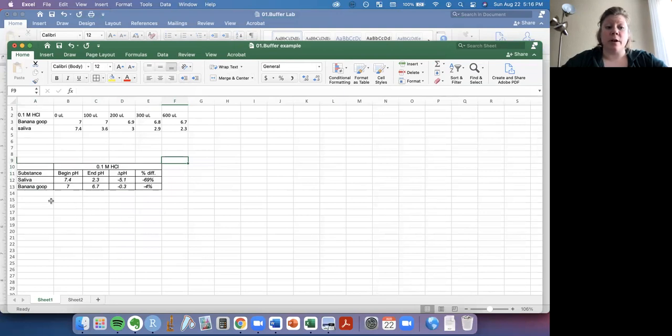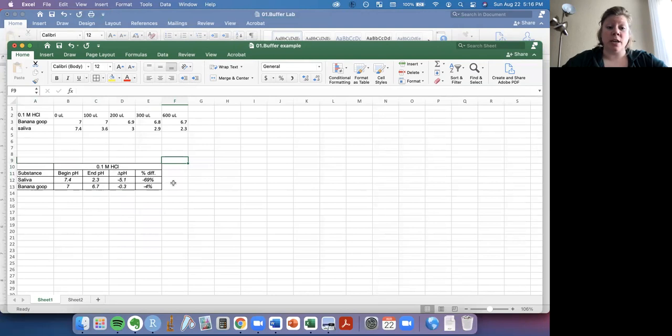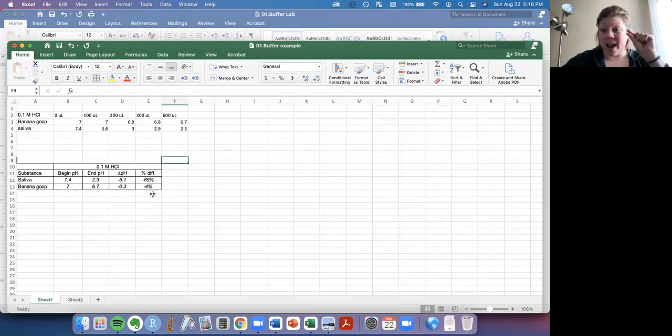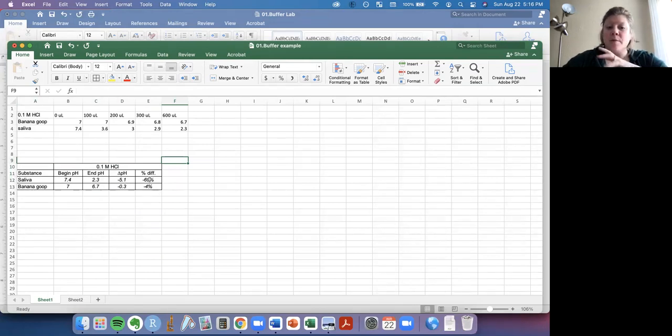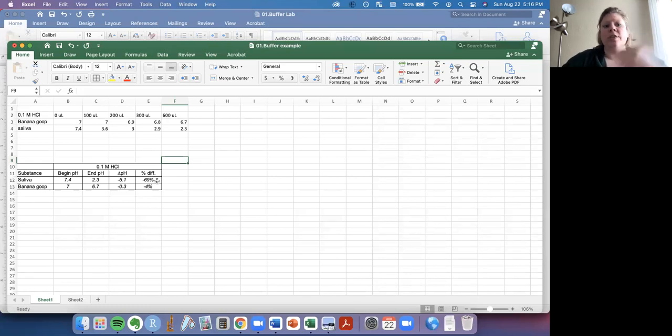This lets me sort of compare our two substances to figure out which one is a better buffer. And I think you can see in this case, banana goop is a way better buffer than saliva. That is the pH changed the least amount with the banana goop compared to the saliva, where the pH changed quite a lot with the addition of that acid solution.